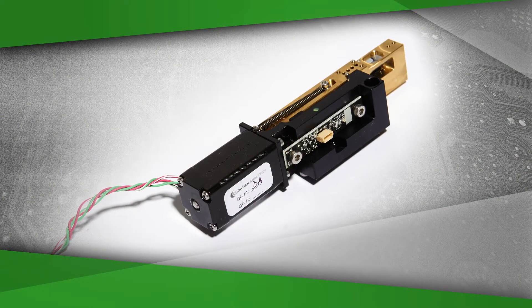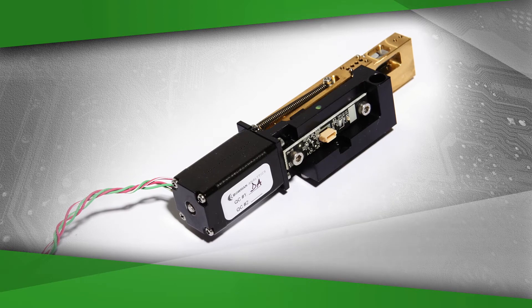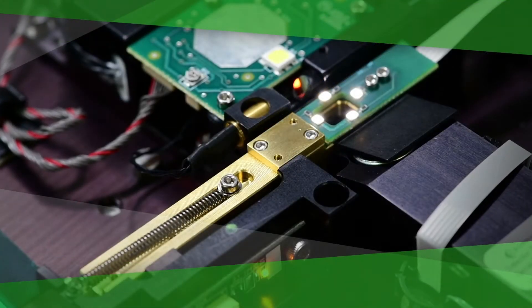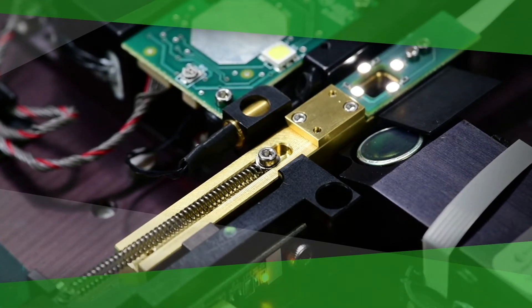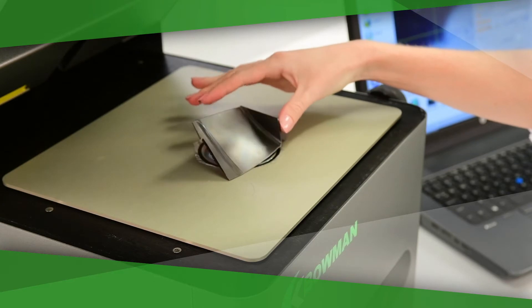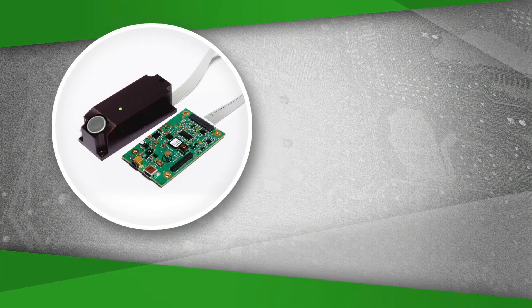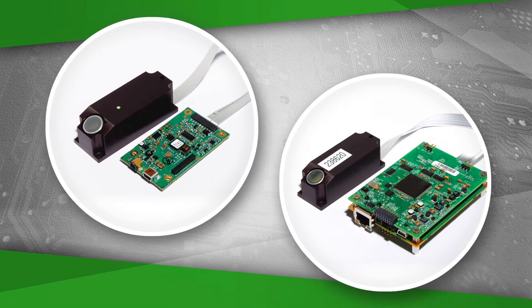The standard G configuration includes a single fixed collimator and a long-life micro focus x-ray tube. As with all Bowman models, instruments can be upgraded to include multiple collimators. A manual XY stage option allows operators to precisely position for the measurement of features less than one millimeter. A silicon pin diode detector is standard with the G-Series, and a silicon drift detector is available as an option.